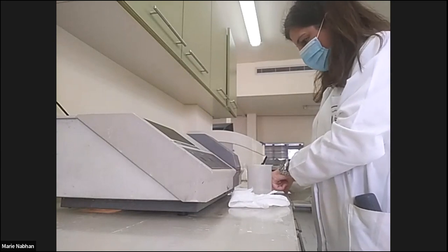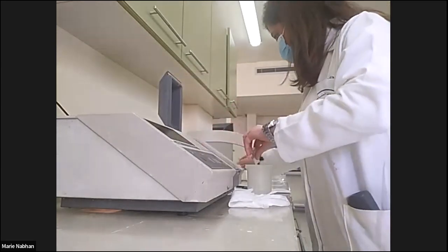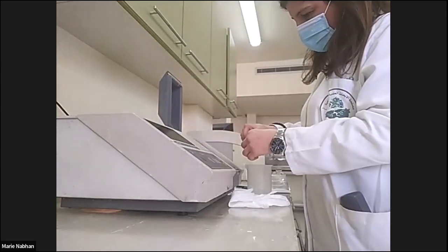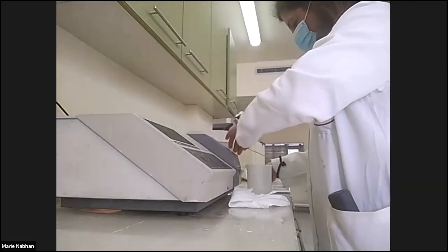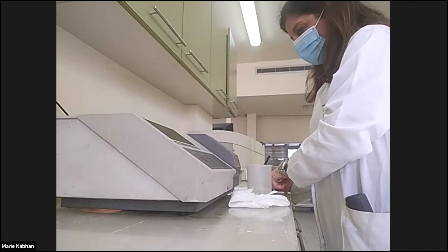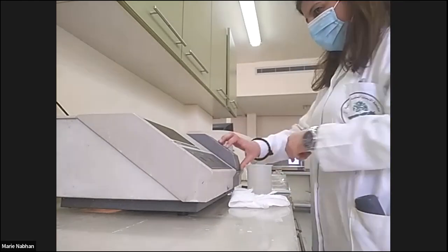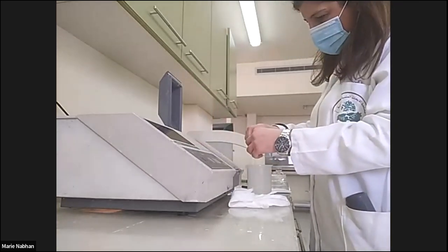The fifth, 0.166, and for the last one, the concentration of the greatest standard is 30 ppm, the reading is 0.191. And now for the sample.